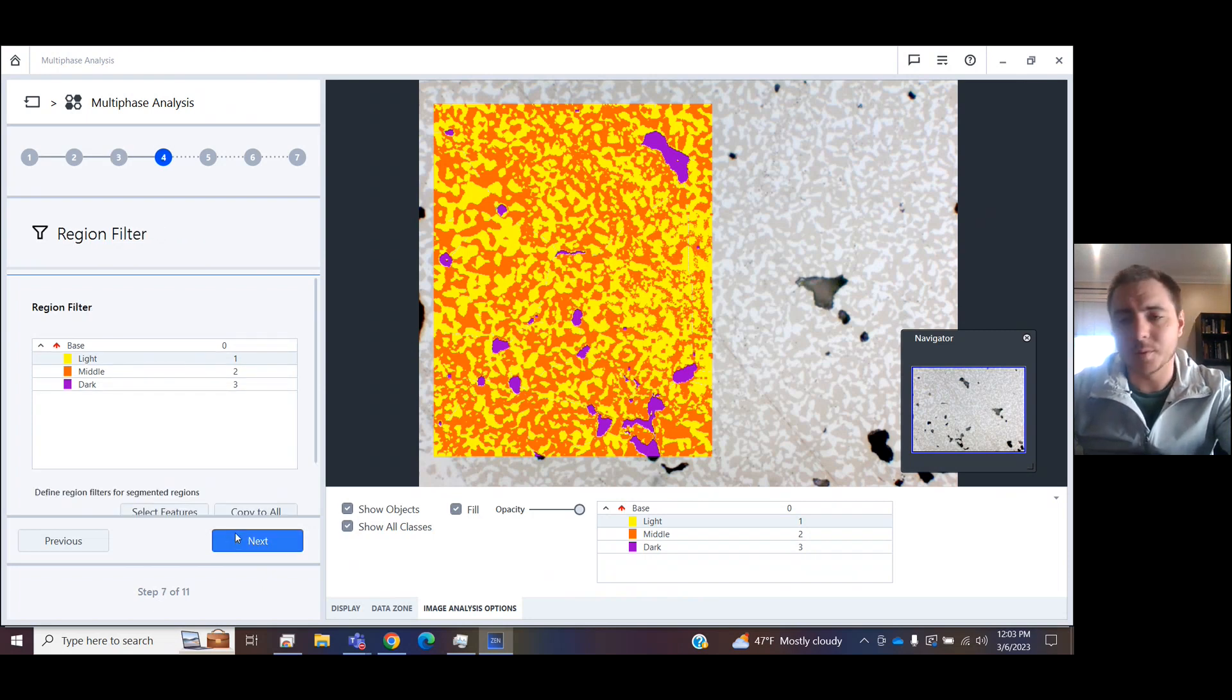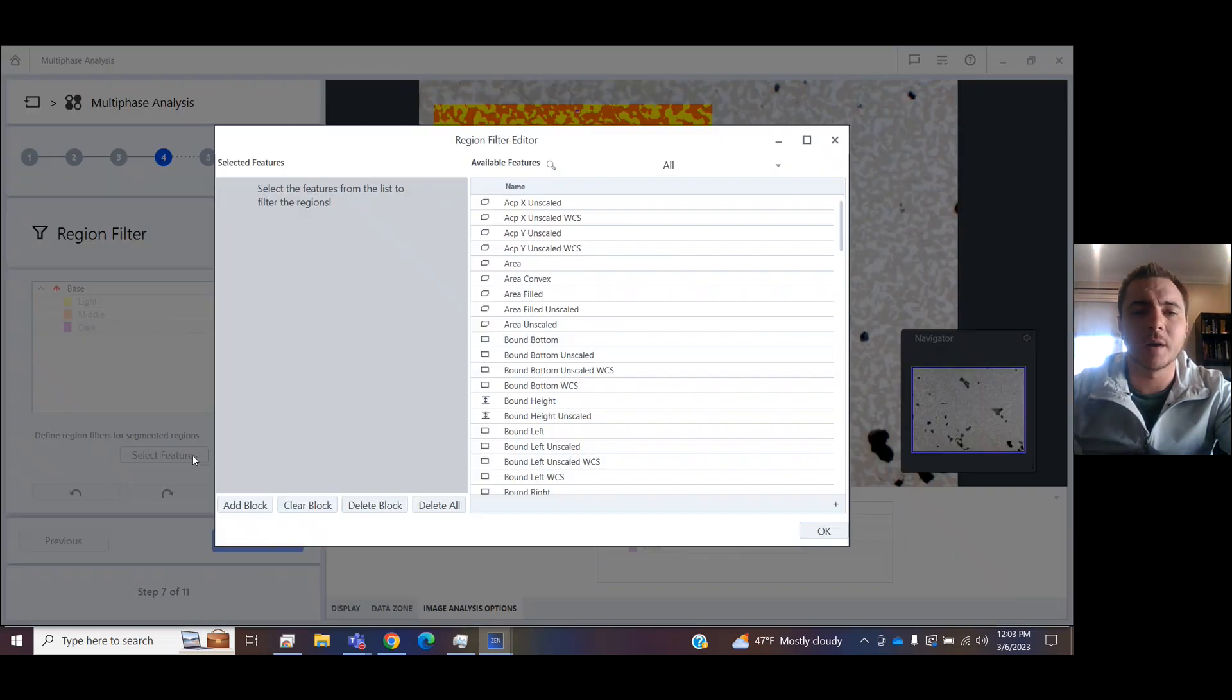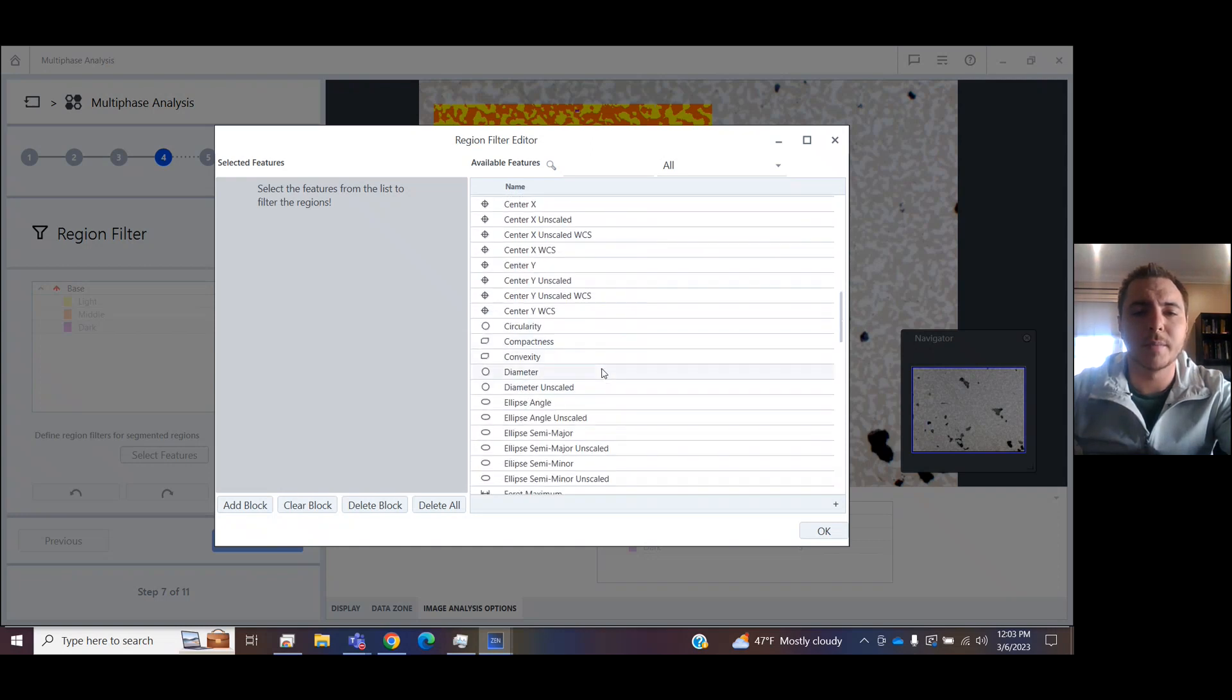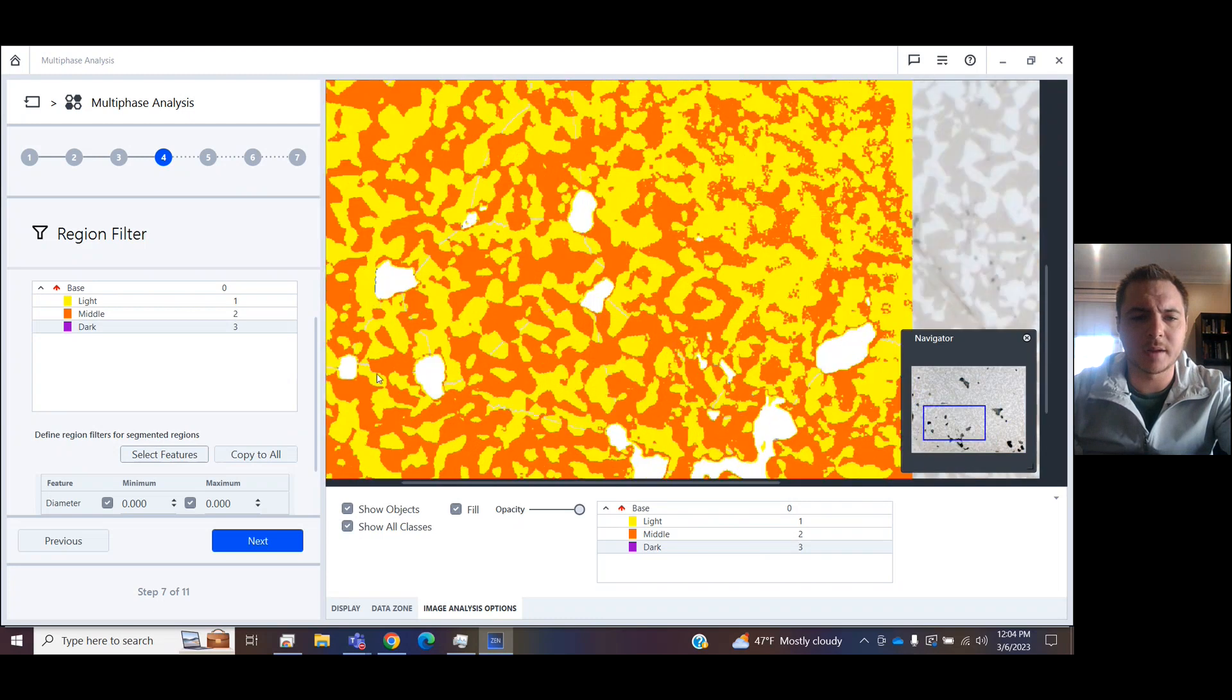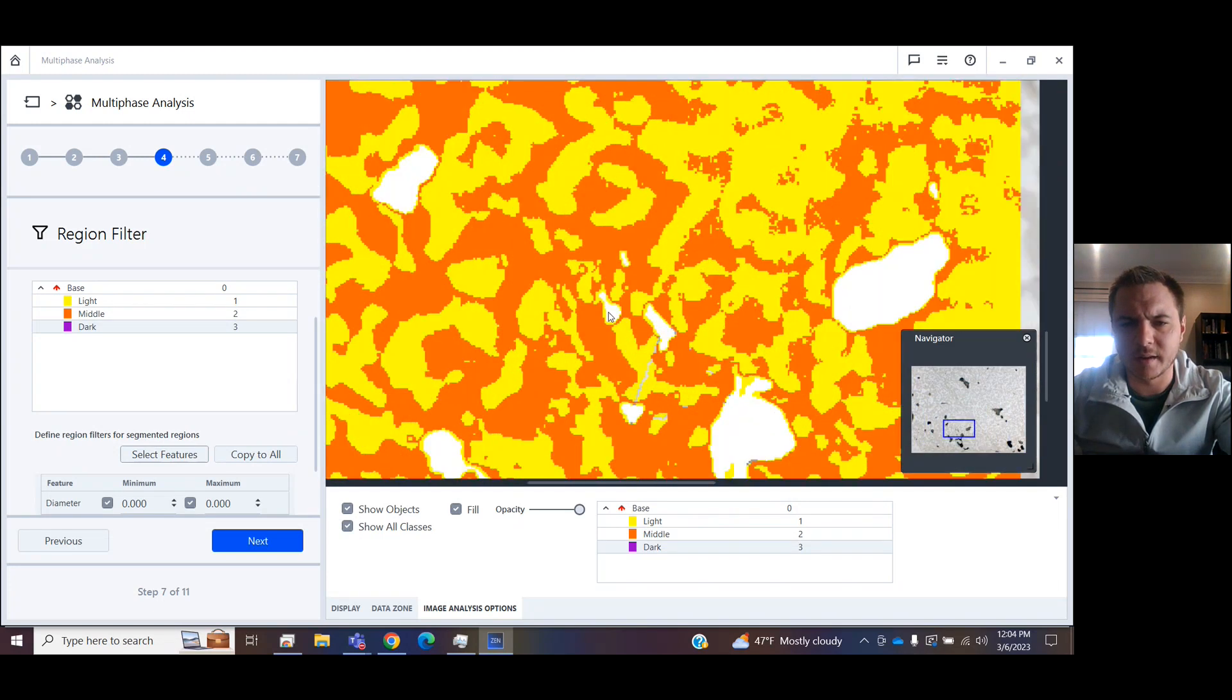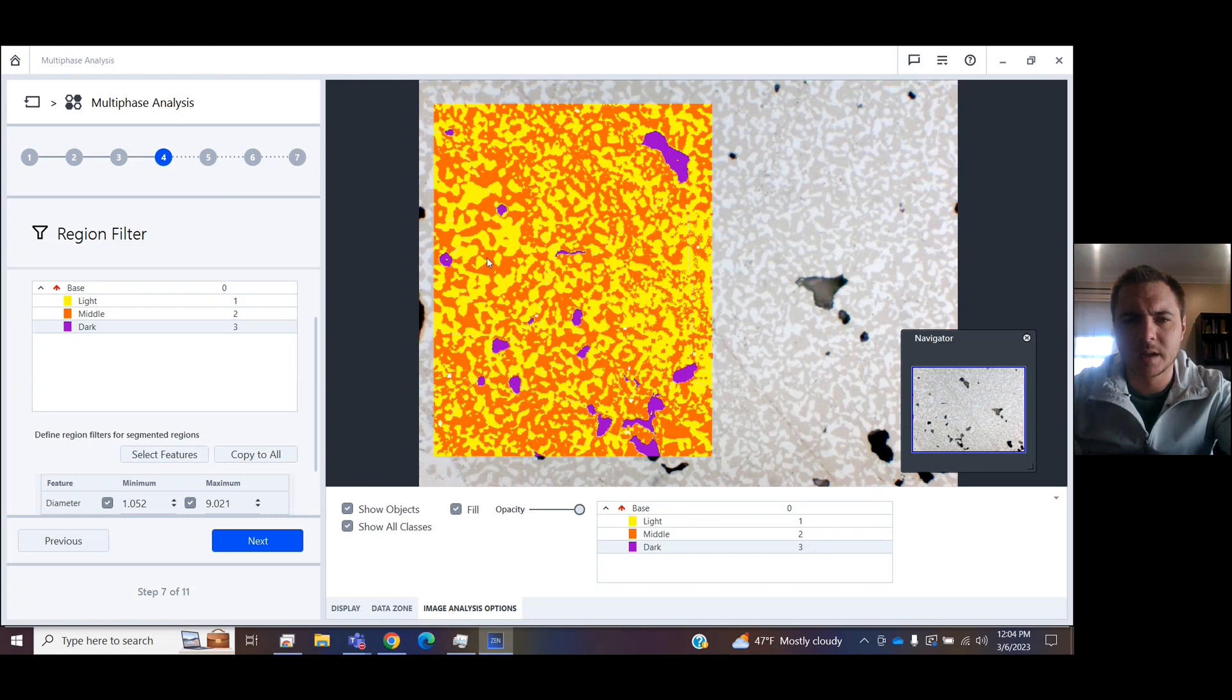After you do the color-based segmentation, you have the opportunity to do region filters on each of the classes. So as an example, let's say I wanted my dark regions to have a minimum and maximum diameter. So I'm going to add diameter, and I'm going to click on the smallest piece I see in here that I want to count. So that, and now I've set a minimum. I'm going to come up here, I'm going to say that's the maximum I want. And so now we've selected all these purple pieces that fit between that minimum and that maximum.